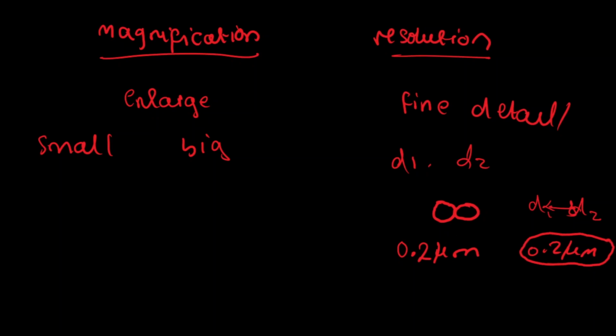They would just appear as though they were one entity. Of course, the microscope would magnify the image and make it bigger, however, it won't be able to tell whether the box is a single box or it's actually made of two compartments, as the case may be.